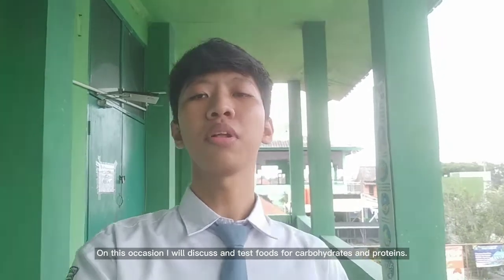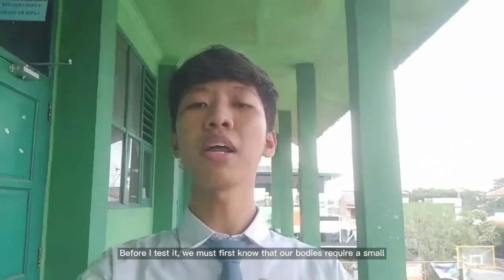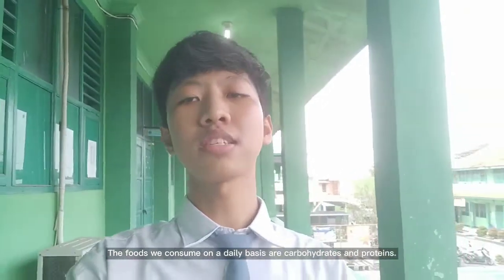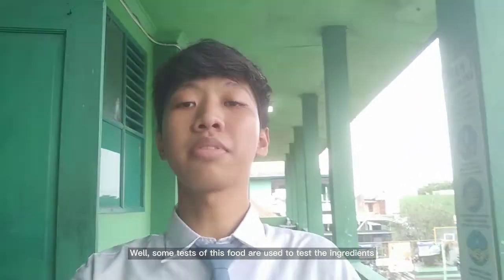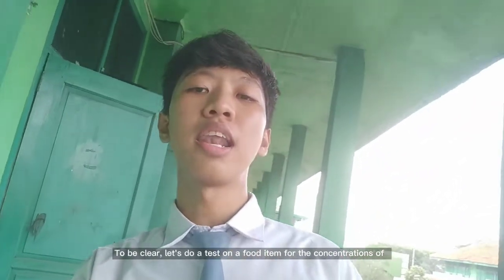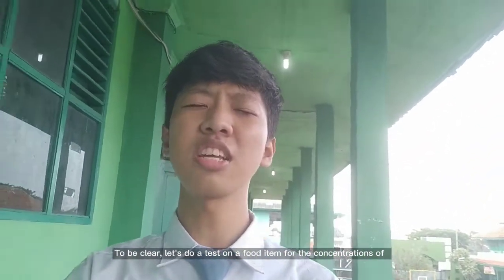On this occasion, I will discuss and test foods for carbohydrates and protein. Before I test it, we must first know that our bodies require a small amount of carbohydrates and protein to perform daily activities. This food can be obtained from foods consumed daily. The foods we consume on a daily basis are carbohydrates and protein. Well, some tests of this food are used to test the ingredients. To be clear, let's do a test on a food item for the concentration of carbohydrates and protein. Let's do it.